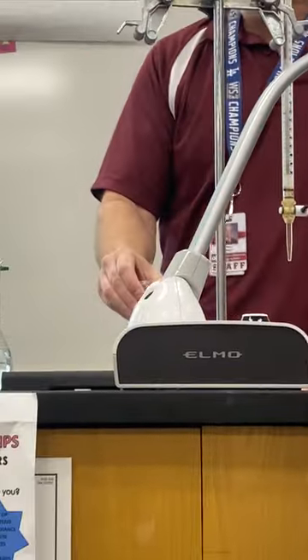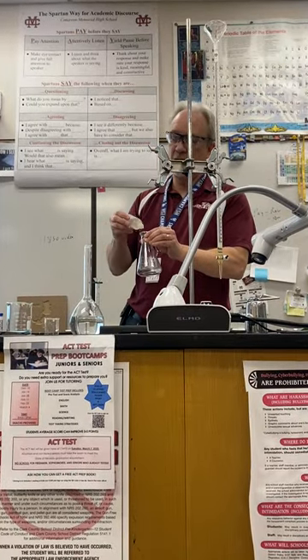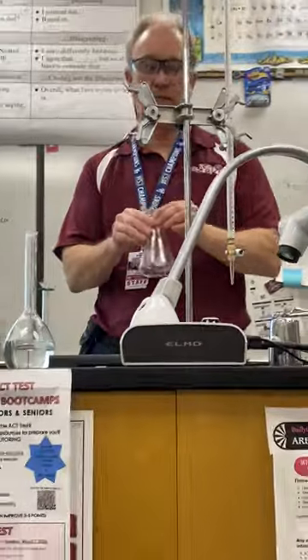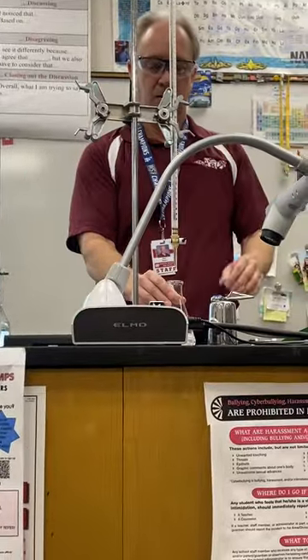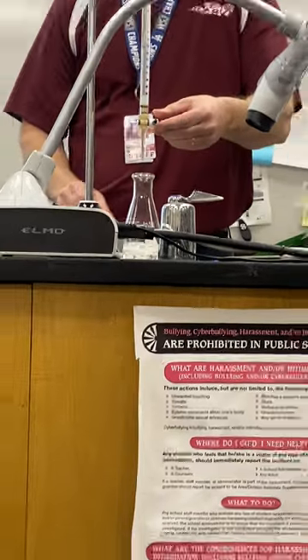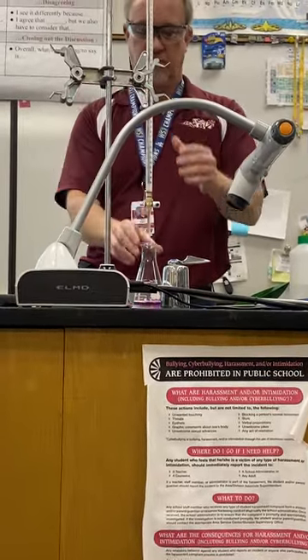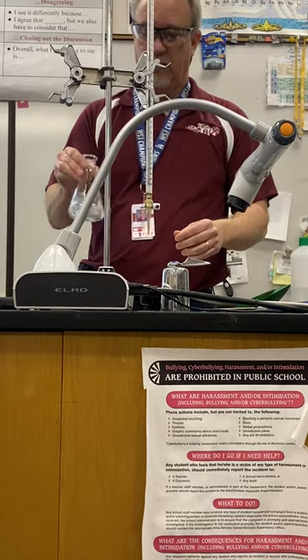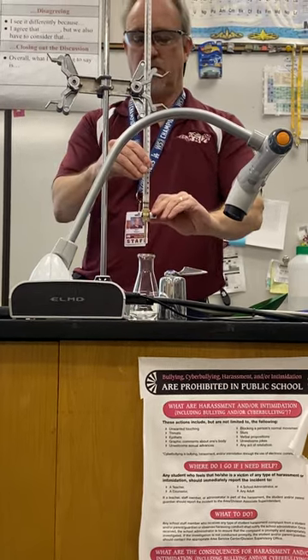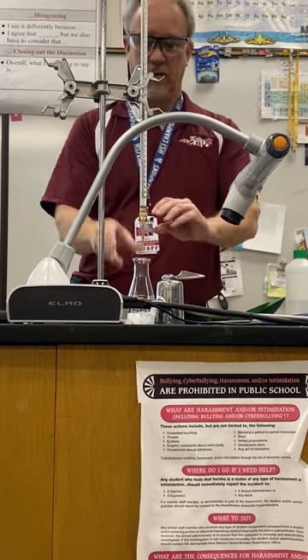So actually one thing I forgot to do, but there was still some in there from before, is make sure I have some indicator in there so I can tell when the color changes. So I'm real close already. So now I'm gonna try to get just a little bit in there.